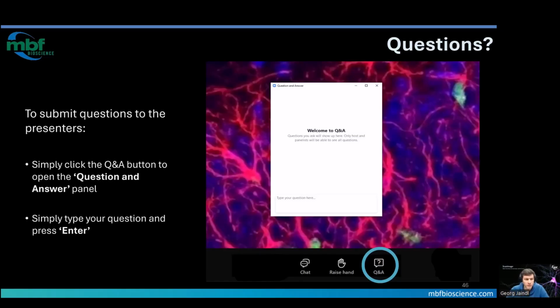One question relates to scanning artifacts in ScanImage when the line phase is not correctly adjusted. So the user is asking, when you start an acquisition, the line phase is off. Then you adjust the line phase and the image looks good, but then you change zoom and the line phase is off again. The reason for that is that the line phase setting might be different for different zoom levels of the resonance scanner. ScanImage internally builds up a map whenever you change the zoom level.